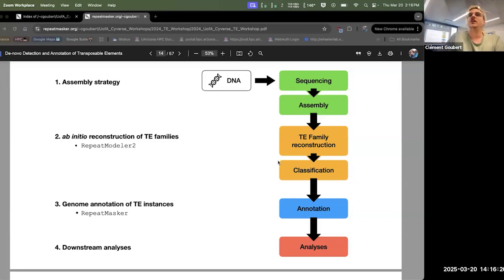You might, for example, especially with the first iteration of noisy long reads, like the first version of nanopore, look at the alignment of a family and say, oh, they look very different from each other. Maybe it's a very old family. Yeah, this is something to keep in mind, indeed. It's quite trendy now to do long reads first and then shorter reads to increase accuracy.